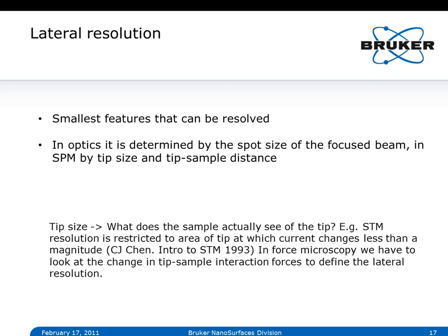And you often hear that in SPM we use these super sharp tips, which is actually not true. In SPM you can use a rather dull tip that you just prepared by using your good old nail clippers. The thing is that the sample only sees a very small portion of the tip because of the exponential tip sample dependence. So in force microscopy we have to look at the change in tip sample interaction forces in order to define lateral resolution a little better.